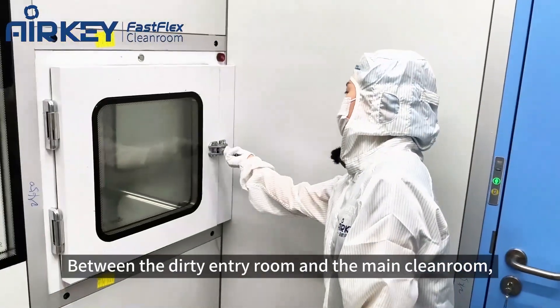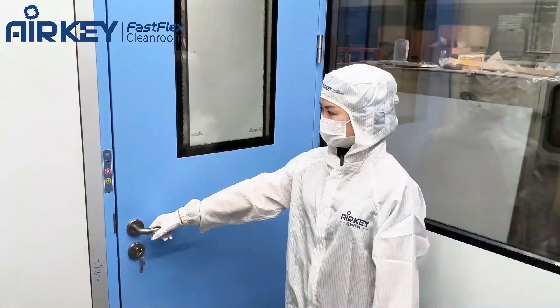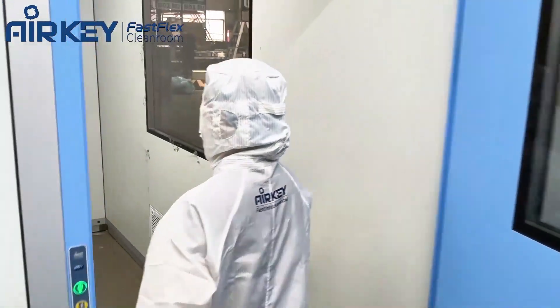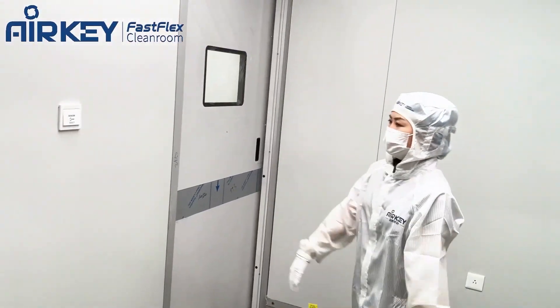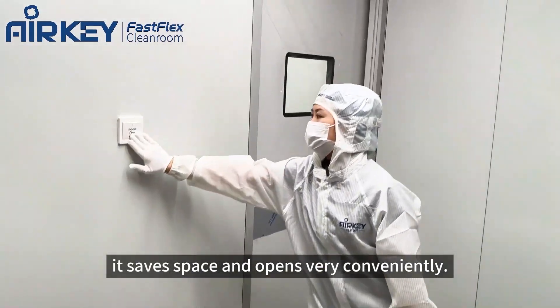Between the dirty ante-room and the main clean room, we have a pass-through for material transfer. Now let's go into the clean ante-room — we have a sliding door here, which saves space and opens very conveniently.